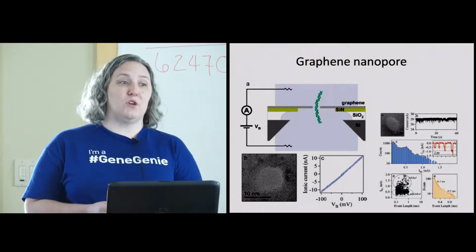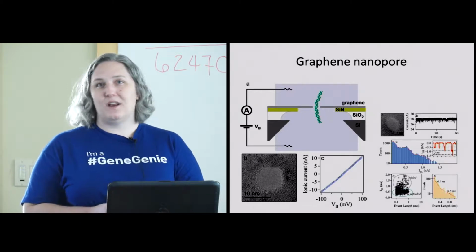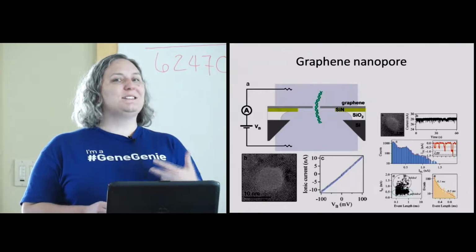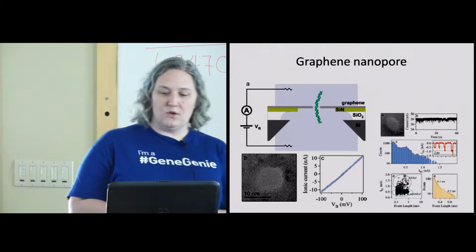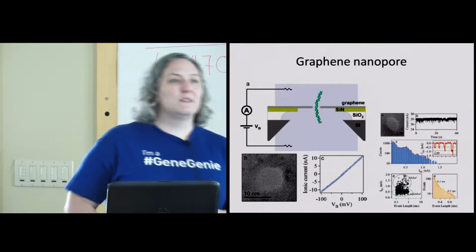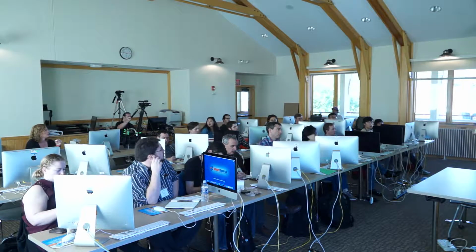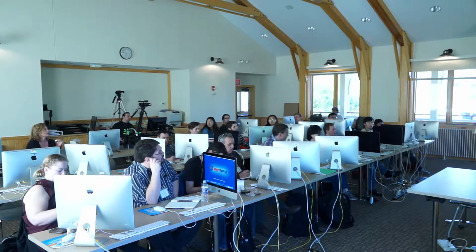With the protein structures, we can actually incorporate additional material, which again we'll touch on in just a few minutes, to help facilitate the DNA as it translocates through those pores. Sarah, is the other challenge of graphene just the ability to machine uniform pores, as alpha hemolysin is always going to make itself look exactly the same every time?